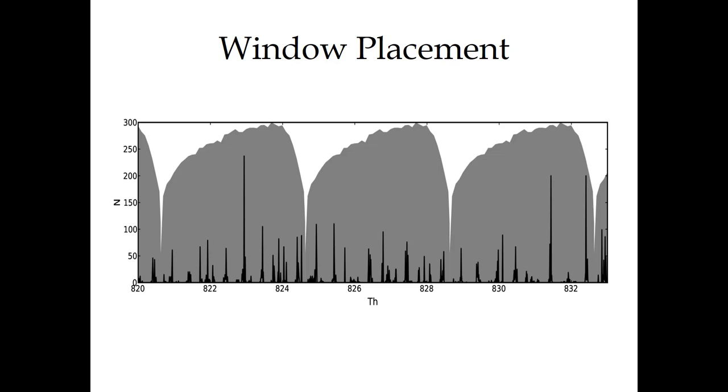And what I can say is the quads on the Q-Exactive Classic are going to look like this. The QE-HF and QE Plus are going to be much more flat. Any of the AB SCIEX instruments are going to be much more flat. They have really good quads. And the Fusion non-Lumos will be somewhere in between.